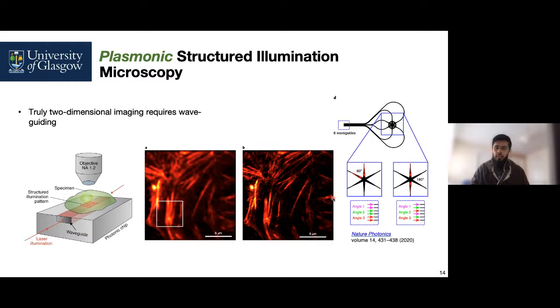And one of the unique aspects of structured illumination microscopy is that it can obtain not only two-dimensional images, but three-dimensional images as well.